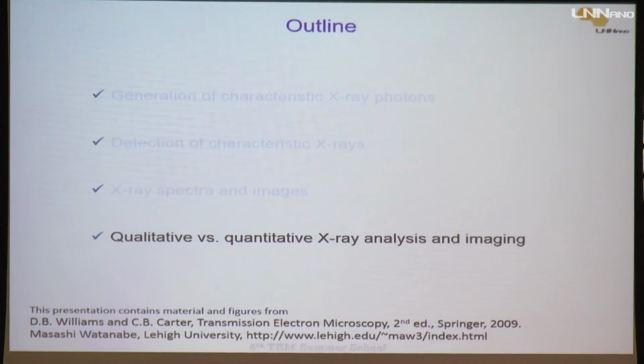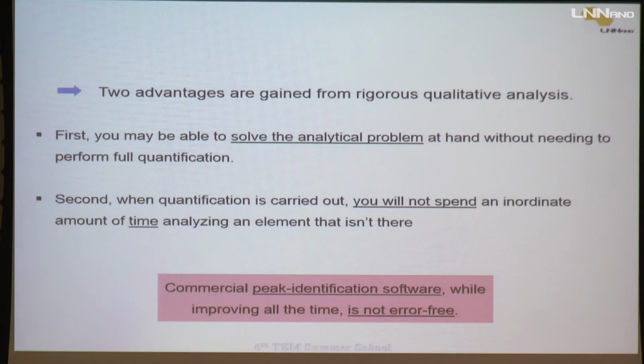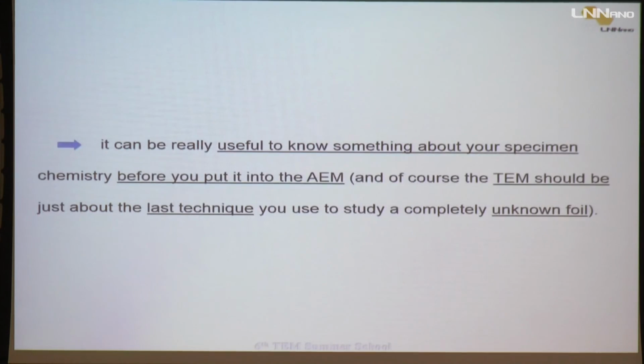Well, now I will go very fast for the last part here, comparing qualitative and quantitative analysis in EDX. It's very important to do qualitative analysis so you don't lose time when you go for quantification.